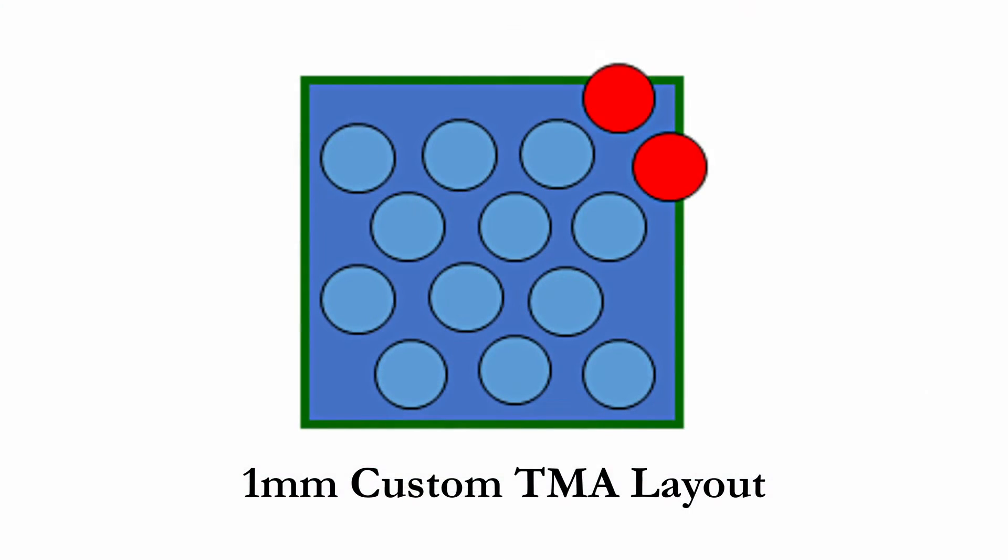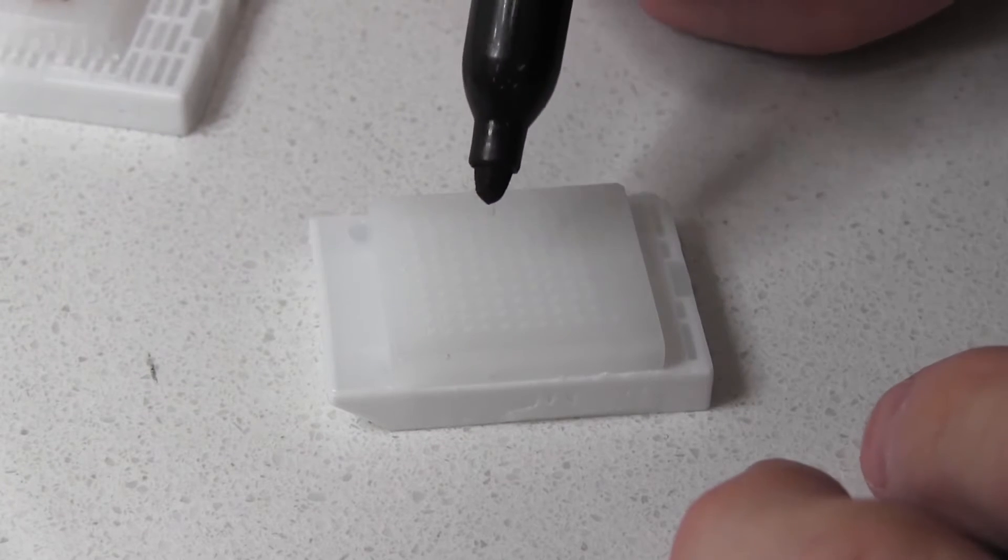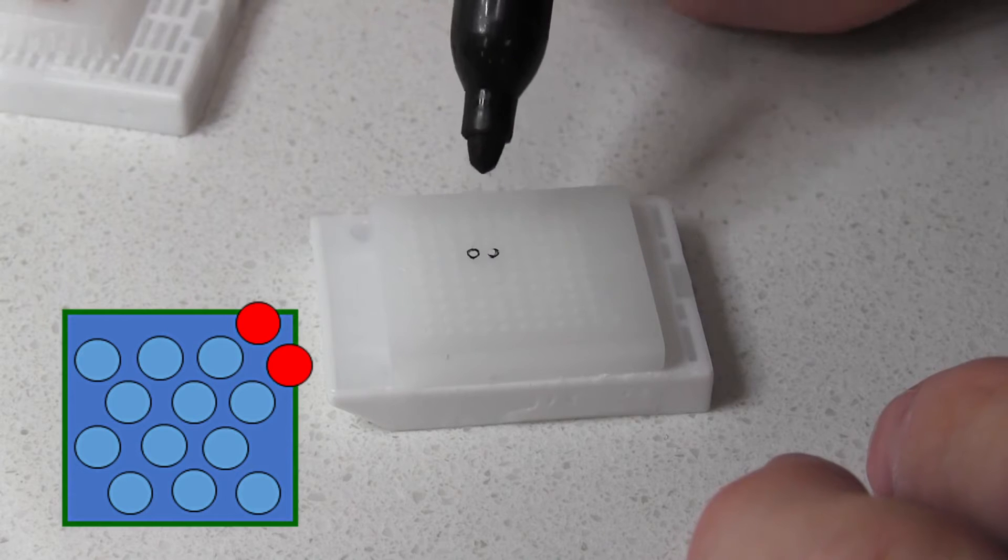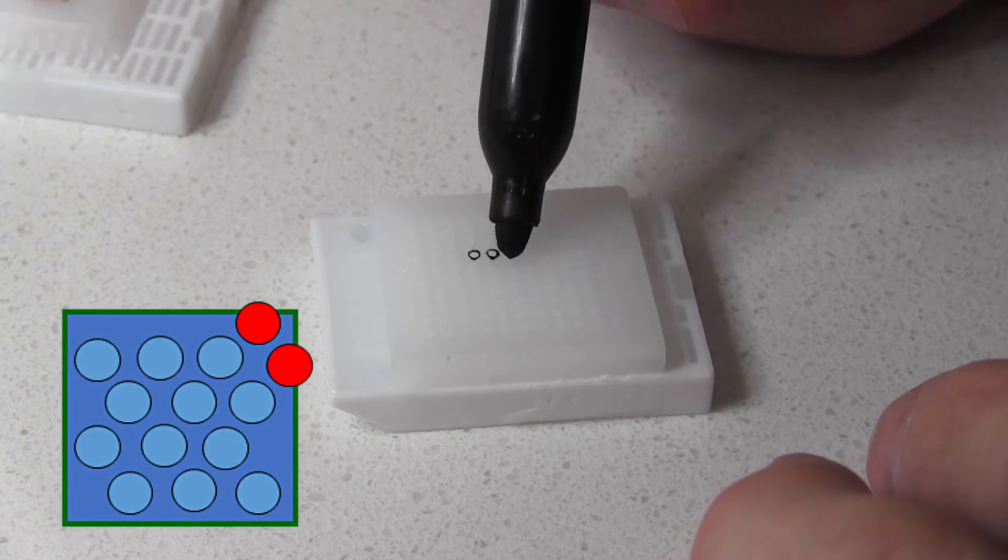This is the custom TMA template we will be using for this project. First what I like to do is mark out the layout on a blank TMA block. A sharpie works really well for this purpose.